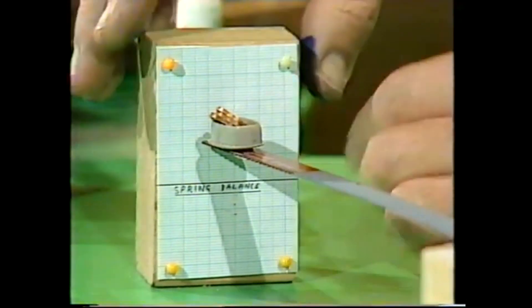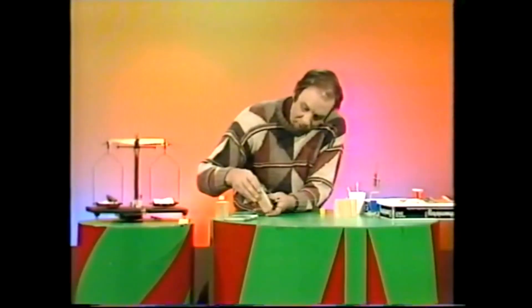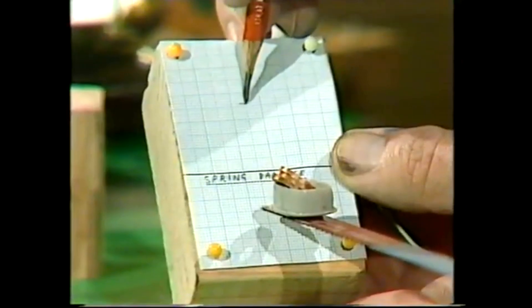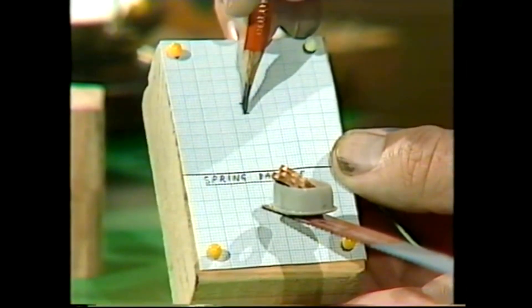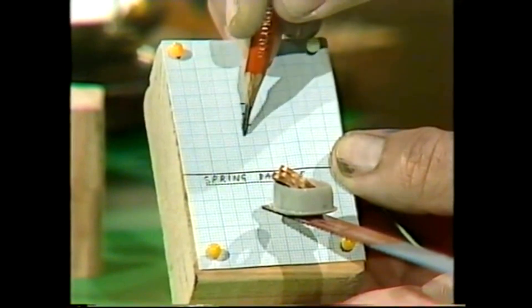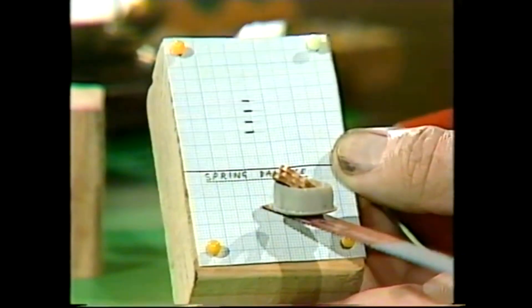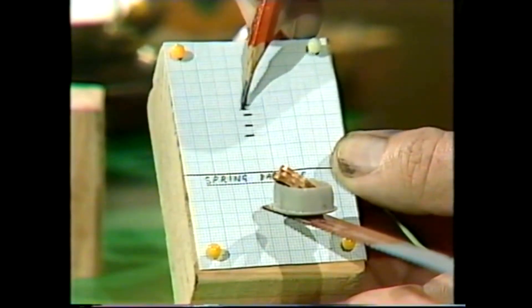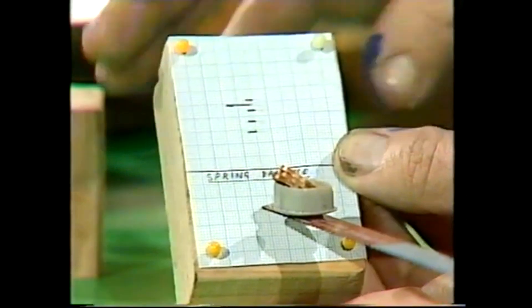Now those are very faint marks, so let's just ink them in with a pencil. Here we go — there's naught, two and a half, five, seven and a half. And if I was measuring out one gram, it would be around about there. I'll make a big line so we can all see it.